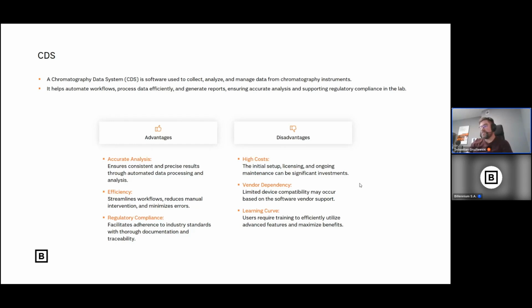What else with this chromatography data system? It can also, like all of them, be interfaced with other systems to easily transfer data. For example, when you want to create a sample set in, let's say, Empower, you want to fill in details like weight, number of injections, amounts, custom fields. You can transfer all this with an interface to such a system.